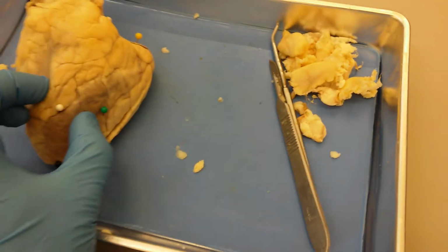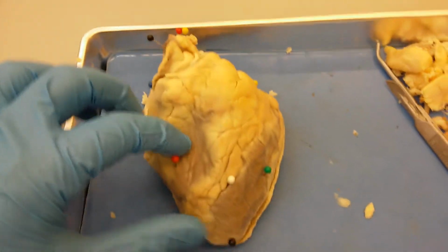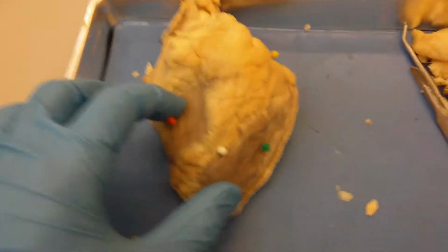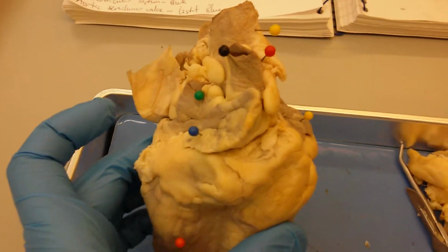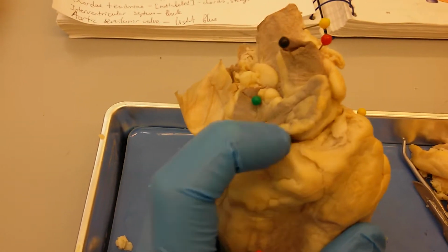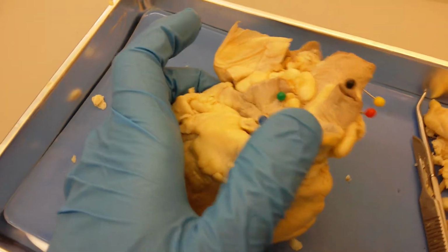If you feel the heart, the left ventricle is going to be harder to feel, and you can see that the right ventricle is more flaccid and softer. And then if you turn the heart over a little bit like this, you will see here with the blue pin, this is the right atrium. And the pin is actually in this structure called the auricle. So this right here is the auricle, okay, that I'm moving right now.